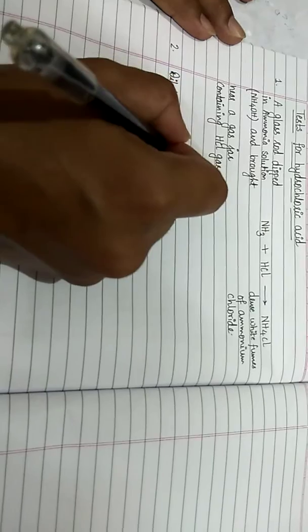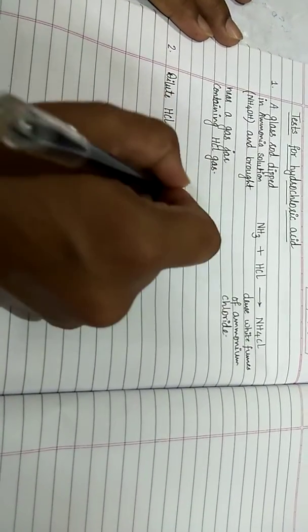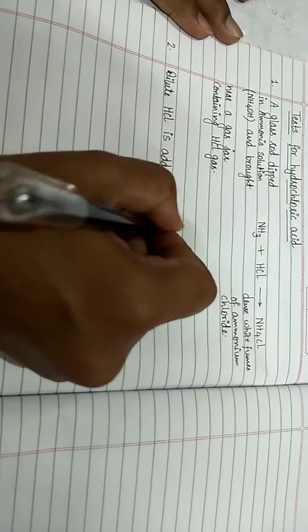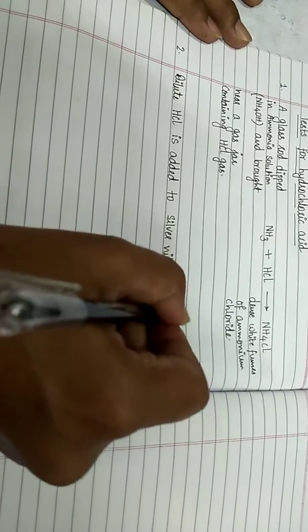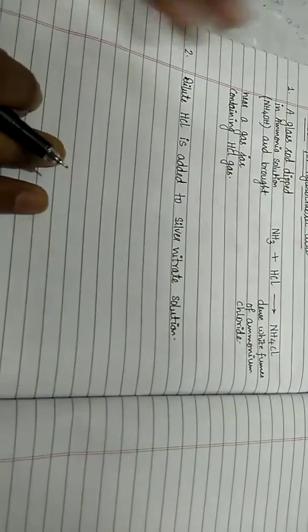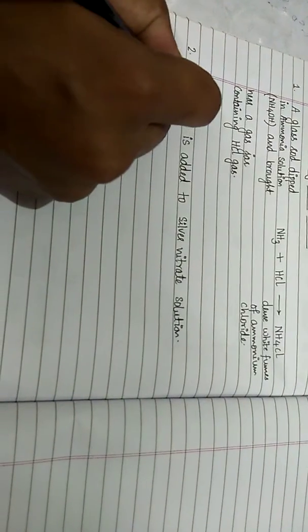Now the second test by which we can identify HCl gas or hydrochloric acid is when dilute hydrochloric acid is added to silver nitrate solution. I've written this reaction behind, so I'll write the reaction first.